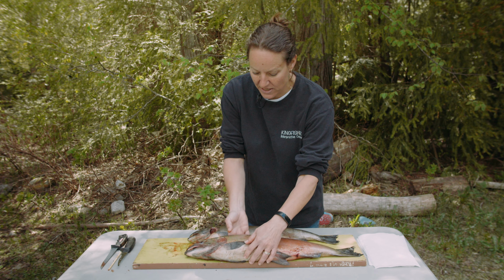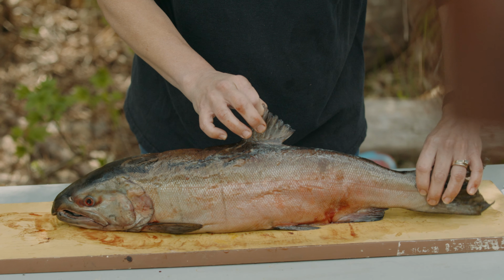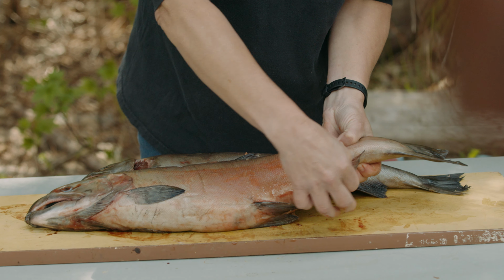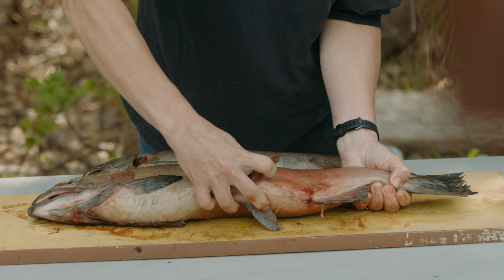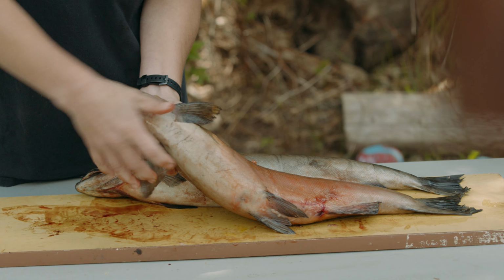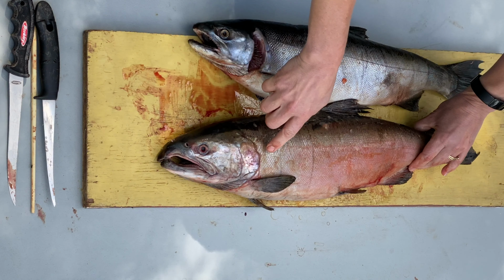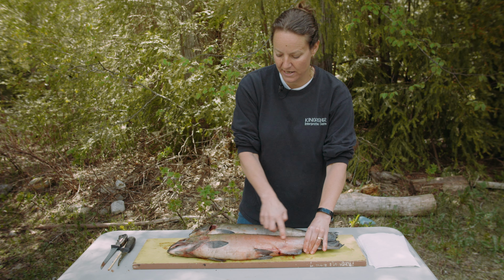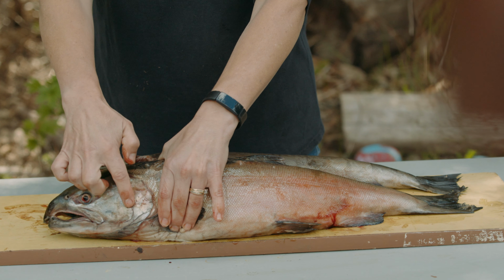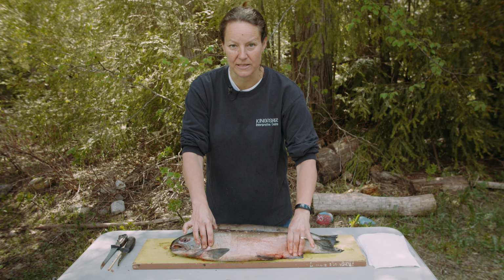Okay, so these fish have a dorsal fin. They have a tail or a caudal fin for swimming. They have an anal fin. They have 2 pelvic fins. They have 2 pectoral fins. Oh, let me get my hand out of there. There we go. They have 2 pectoral fins. They have a lateral line outside their body running down there. They've got eyes. They've got nostrils. They breathe through gills, and they're covered in slime and scales.